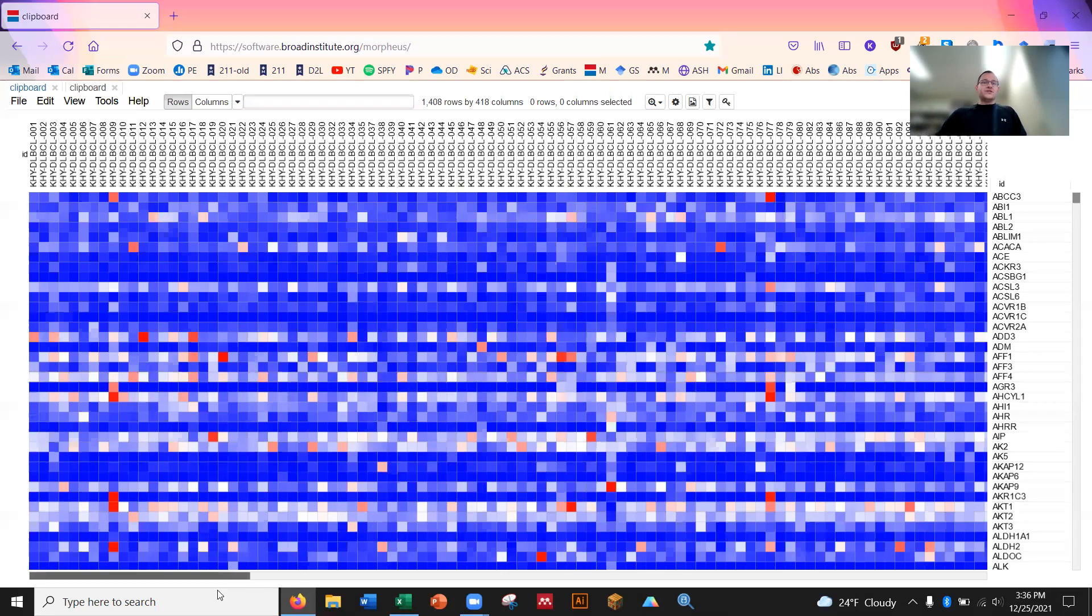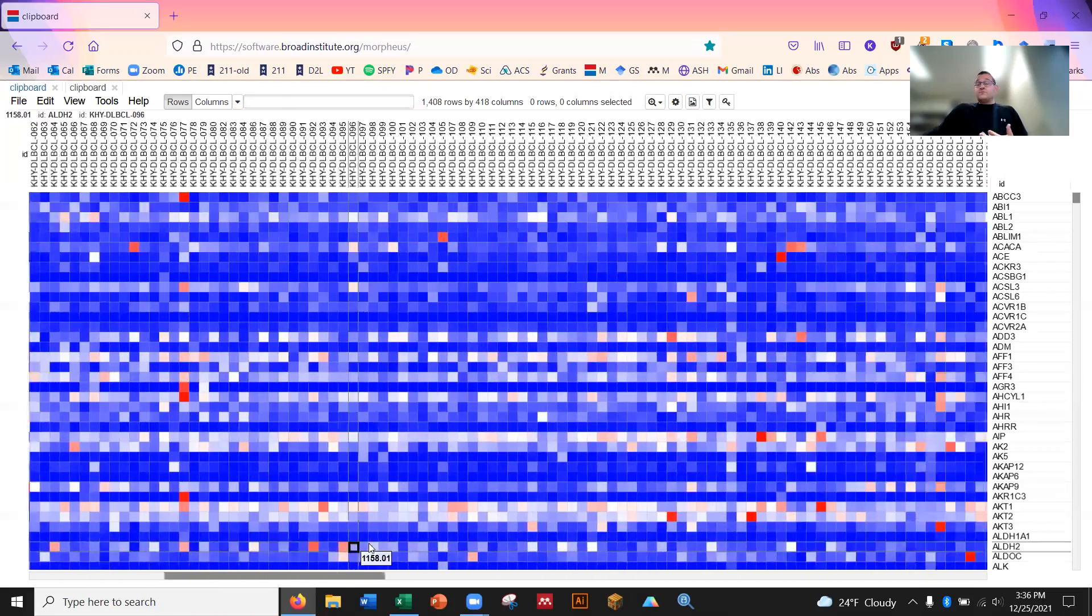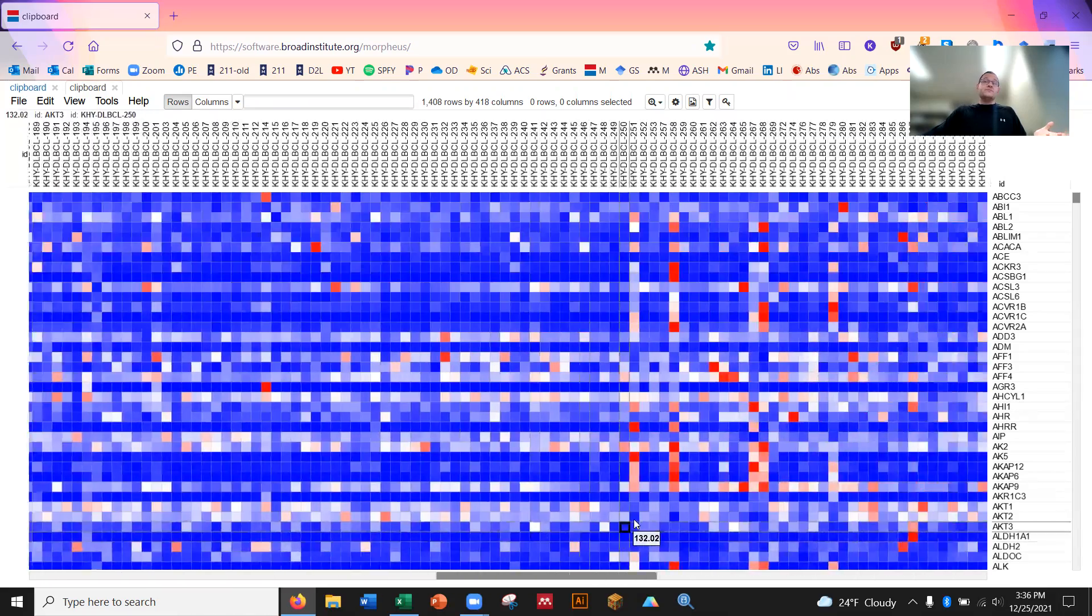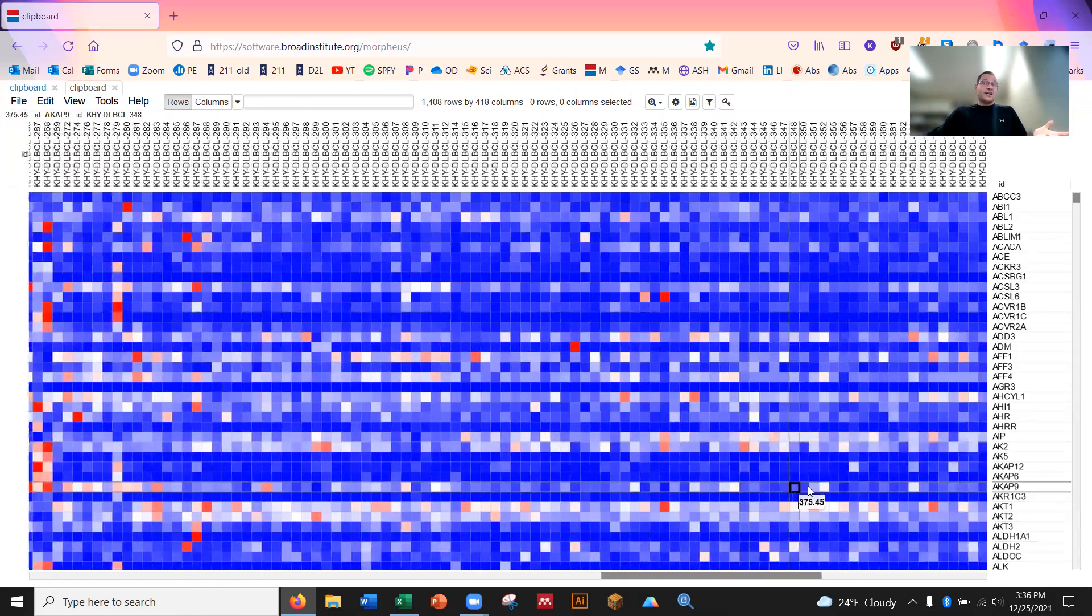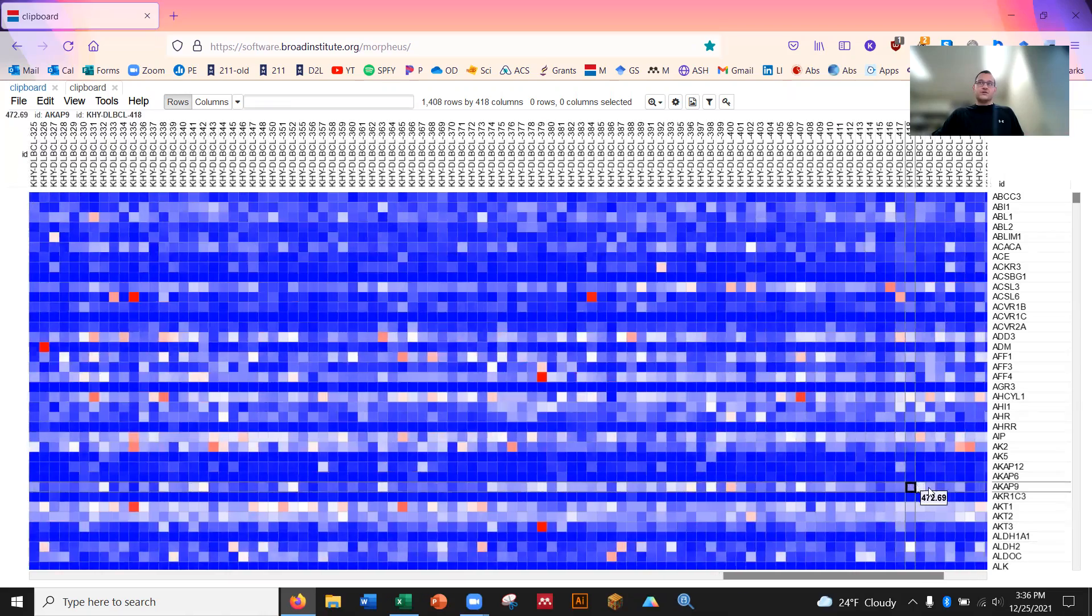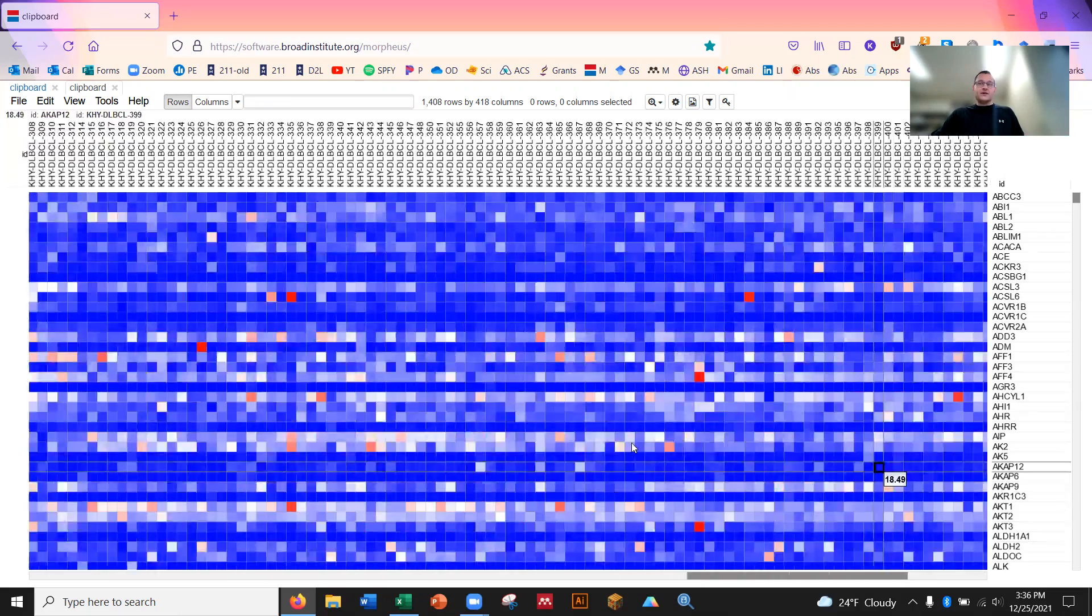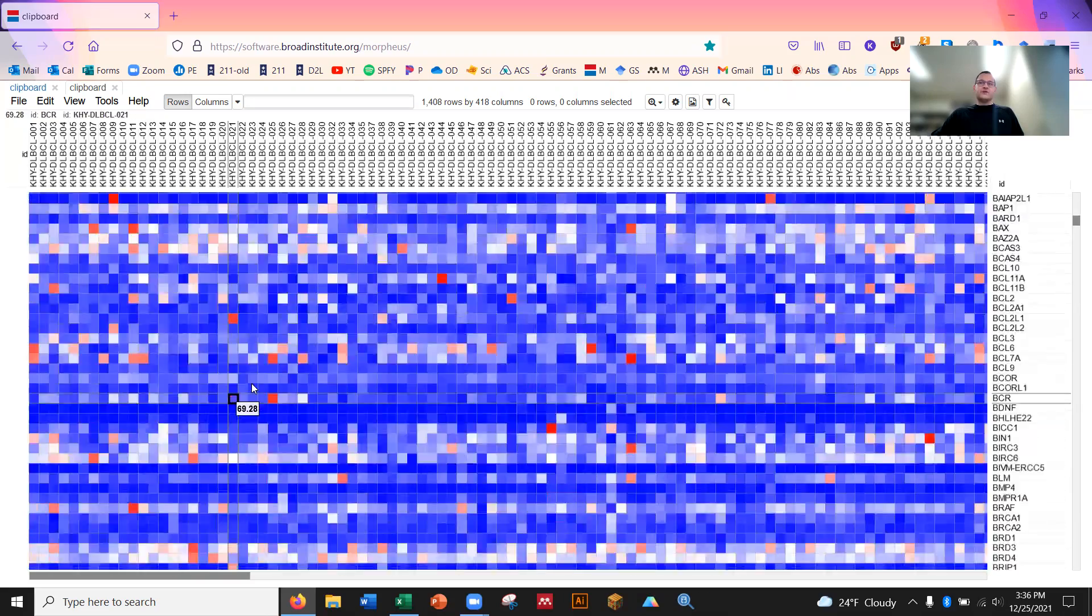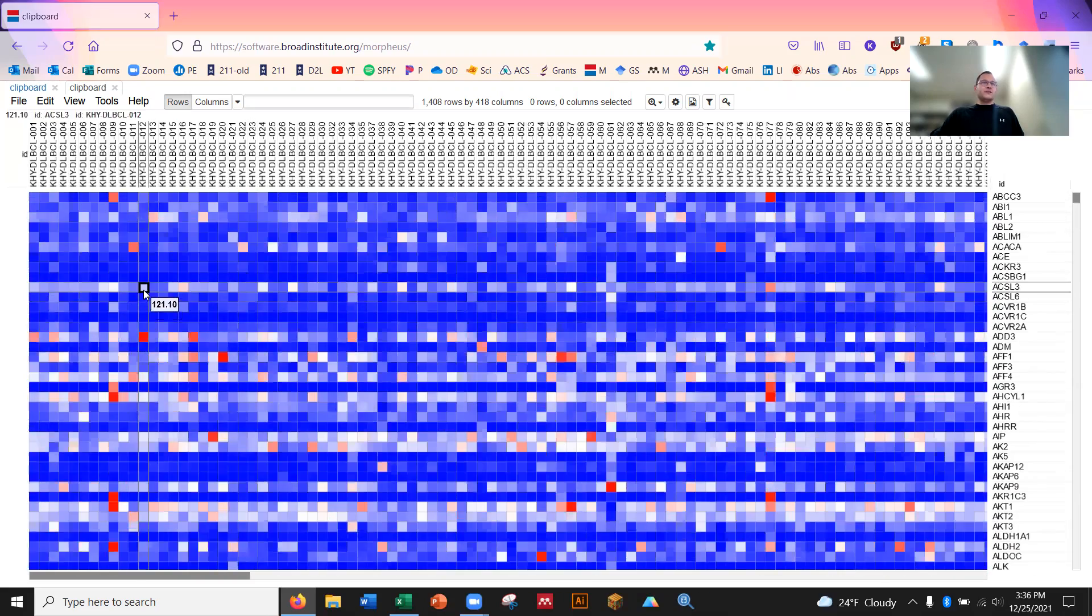So go ahead and you'll actually have to transpose this. The program reads rows relatively. So what you're seeing right here with colors is the relative expression for each row. And as you can see, as we scroll around here for these genes on the right, people have different expression levels of genes. And on the top, you see all the patients. Pretty cool. Red meaning high expression, blue meaning low, middle or low and white or that tan gray kind of the middle.